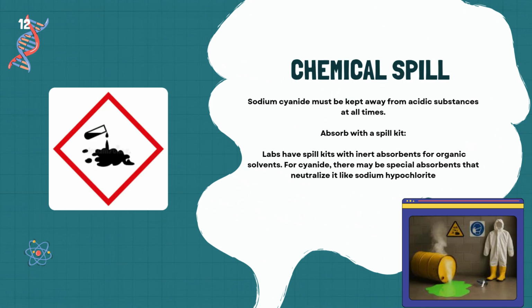Next is chemical spill. Sodium cyanide must be kept away from acidic substances at all times. Labs have a spill kit with inert absorbents for organic solvents. For cyanide, there may be special absorbents that neutralize it, like sodium hypochlorite.